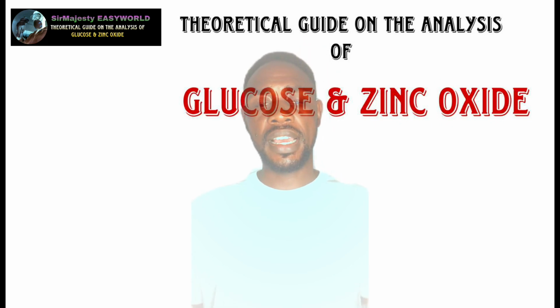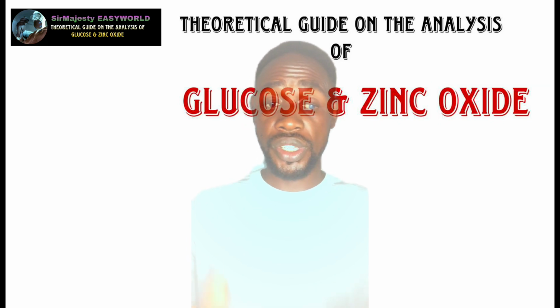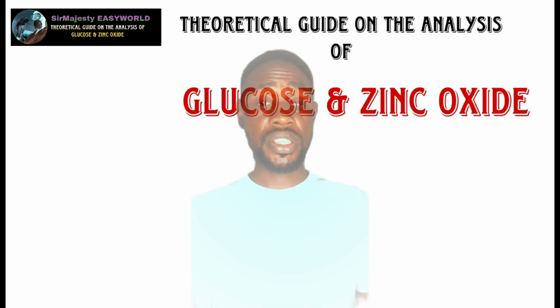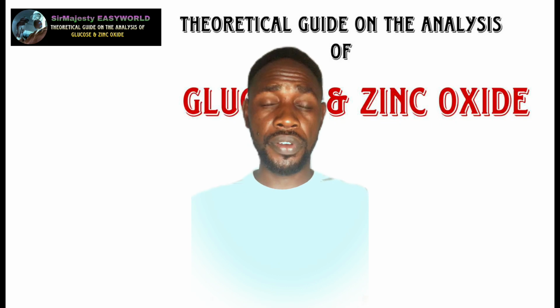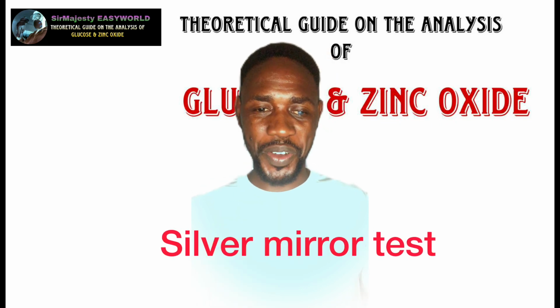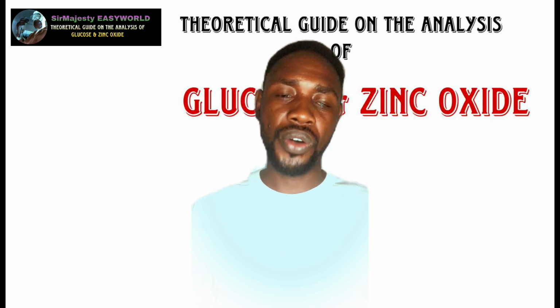So if you are analyzing glucose, for example, you should first of all remember that glucose is a reducing sugar. So you should go and study about the test for reducing sugar using Fehling solutions. Then you will also get prepared for the silver mirror test. Yes, of course, because the reagents that are required for this silver mirror test are all there.